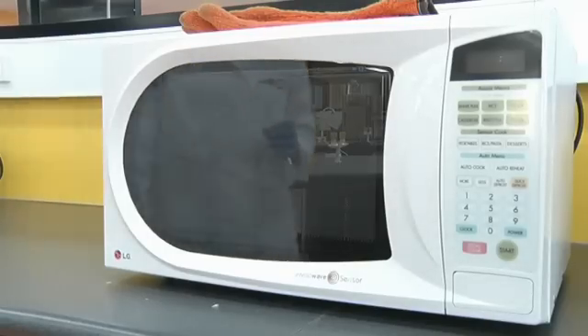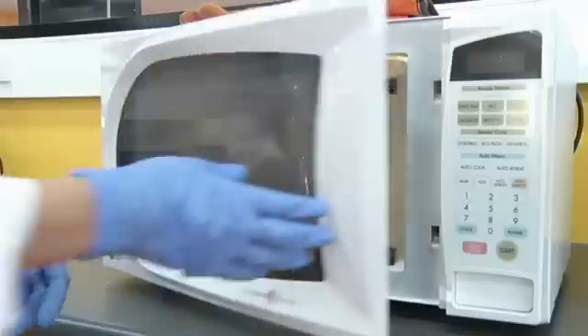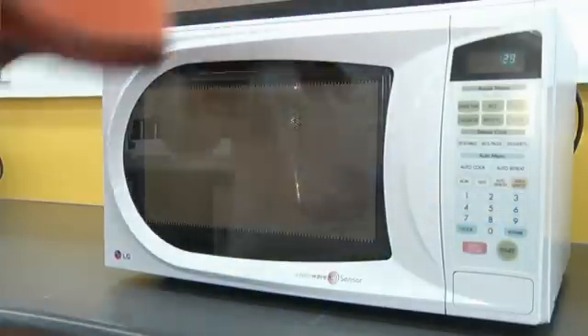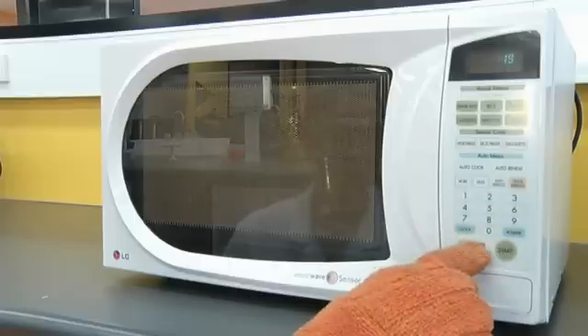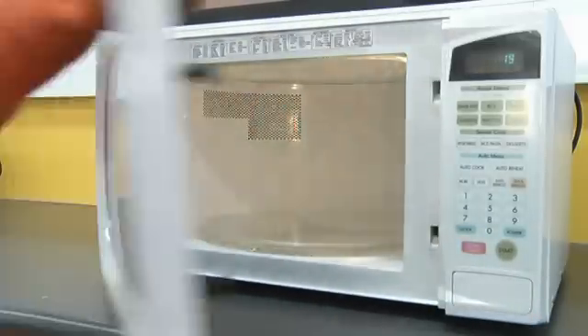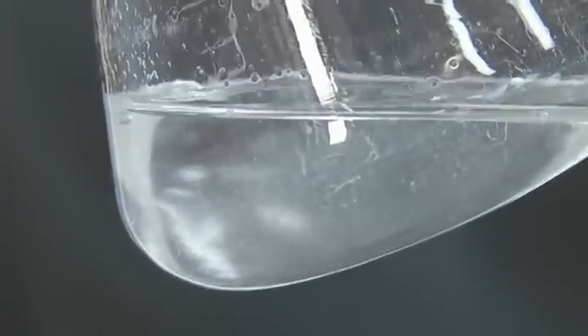Microwave the flask on high for 30 seconds. Keep a close eye on the flask to ensure it does not over boil. Periodically stop the microwave and, while wearing heat proof gloves, swirl the flask. Initially the agarose granules will appear as small translucent lenses. Keep microwaving and periodically swirling until these disappear and the agarose is clear.